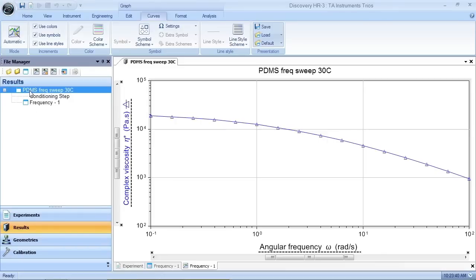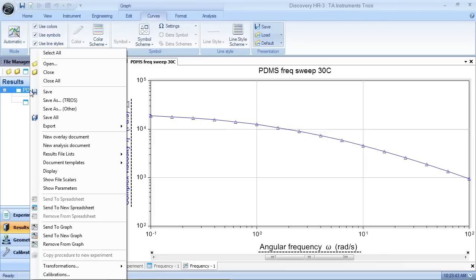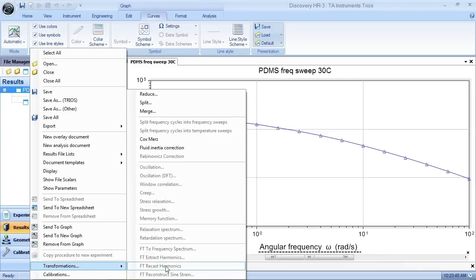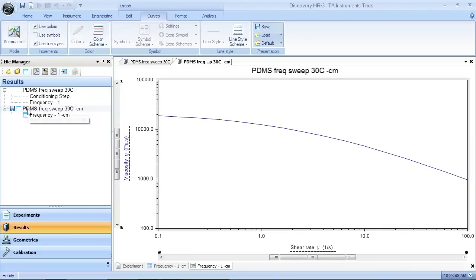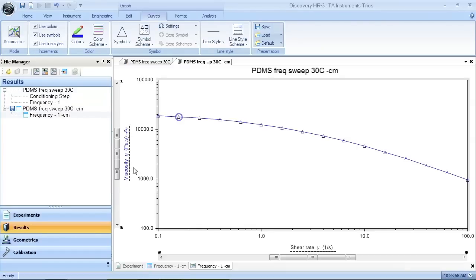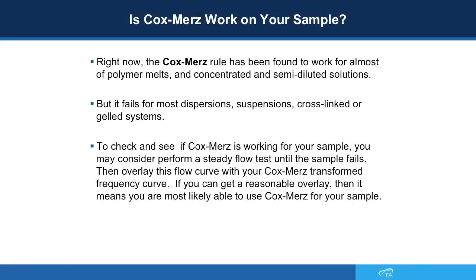Then right-click your mouse on the file name and choose Transformations > Cox-Merz. Now you have generated a new data file with the same file name with the extension dash CM. When you look at this data file, you can see that the complex viscosity has been converted to shear viscosity and the angular frequency has been converted to shear rate.